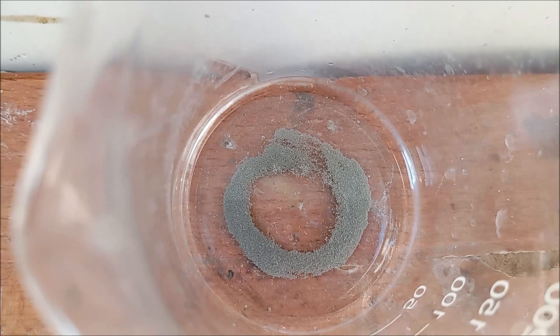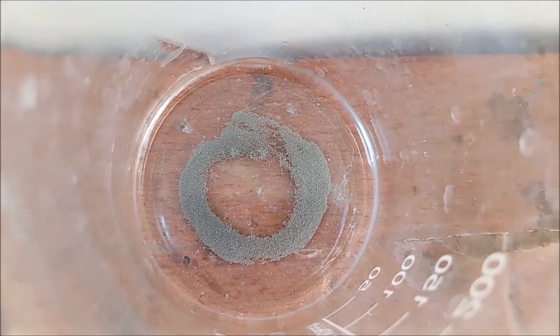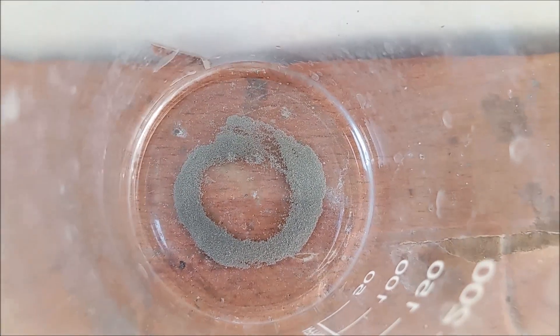Sulfuric acid attacks nickel metal very slowly. Tiny bubbles can be seen on the surface of the metal but not much is happening.